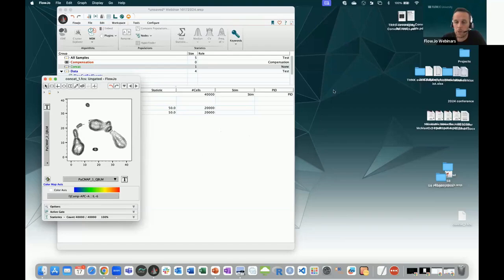That's a good rule of thumb on the quantity of RAM that you can use, or the other way around, the quantity of data that you can put in FlowJo to run that. With all those algorithms, there's a lot of math involved, so there's a lot of calculation. So even if you have the most powerful computer, you may have to wait sometimes at least a few minutes, sometimes maybe even hours, depending on how many cells you have in your data set.